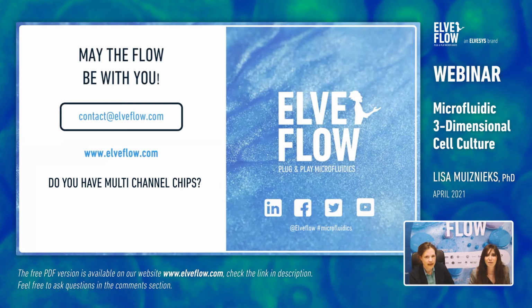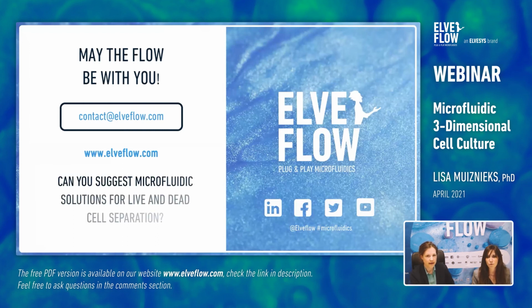Another question from Abdi Nandan. Thanks. One more question. Can you suggest microfluidic solutions for live and dead cell separation? That's a tough question. I mean, it's a tough problem. I mean, thanks for your question. No, I'm not sure. Tracking live and dead cells, obviously using dyes is one thing. Staining with trypan blue or propidium iodide or something, and actually counting them to know which cells are alive and which cells are dead is one thing, but separating them, no. Not sure. No. I think that's a hard topic.